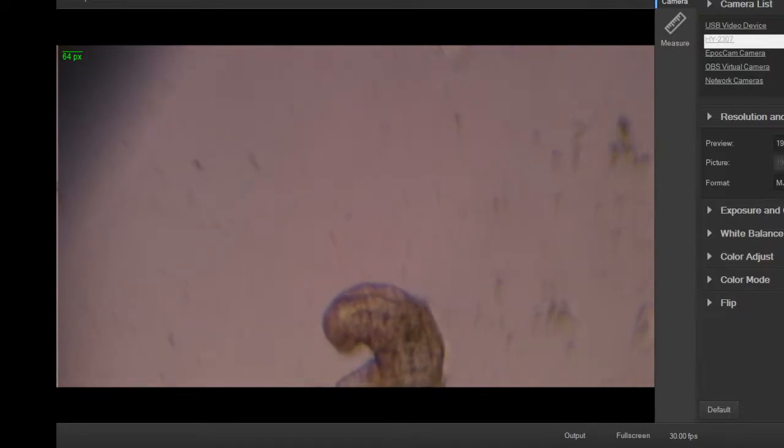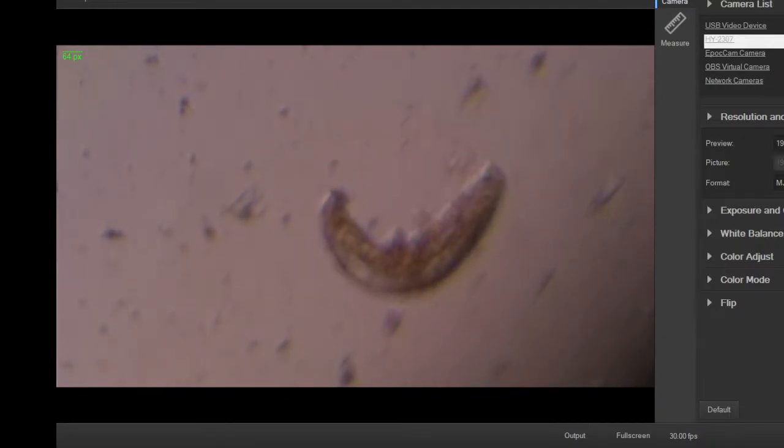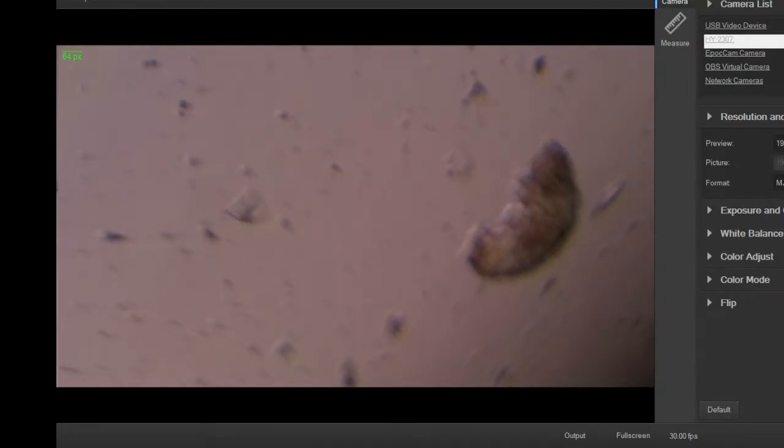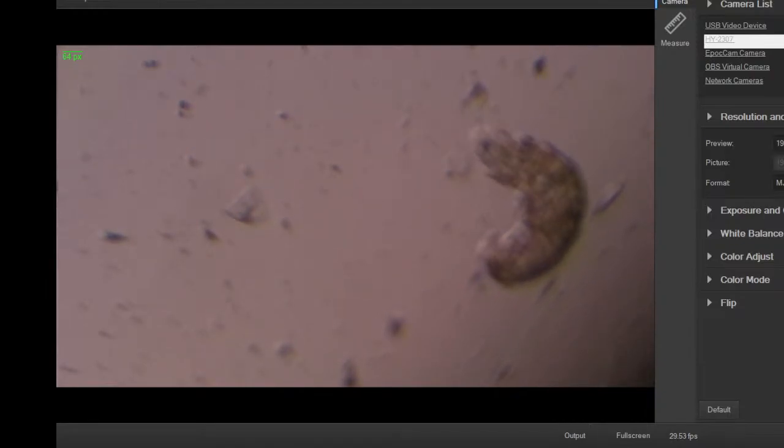I should say he is more of an it, because they do have male, female, but I can't tell from this because it's not carrying a cluster of eggs. And you can also identify the species from body parts, what the claws look like. You can actually see the little claws. If I could zoom in on this, but I can't risk it with this one. I'll have to transfer them to a slide if I want to get a better shot of them. You can see the claws on the feet really well, so that's where the water bear concept comes in. It's got these kind of long bear claws on its feet. But yeah, that's a nice little guy.